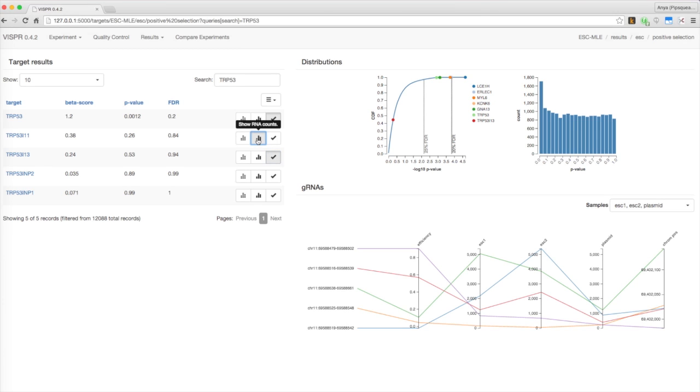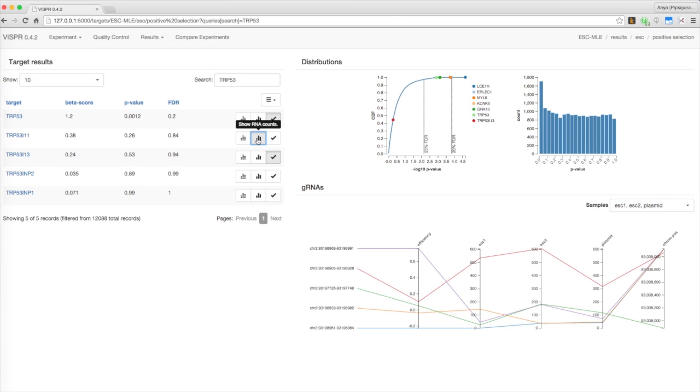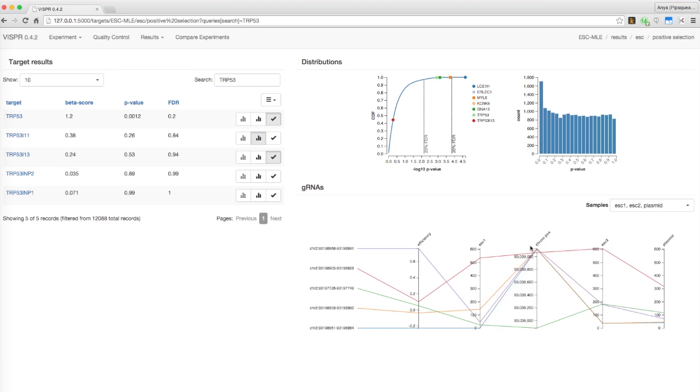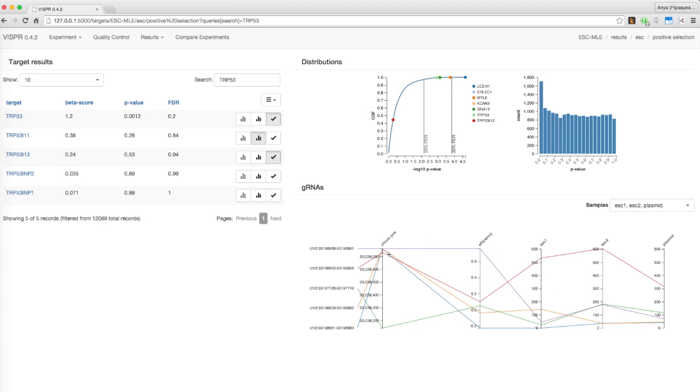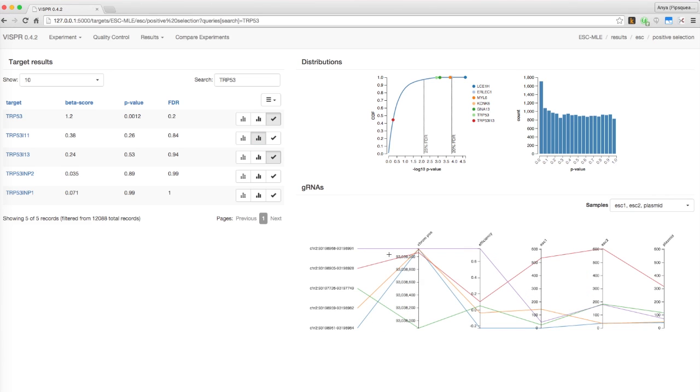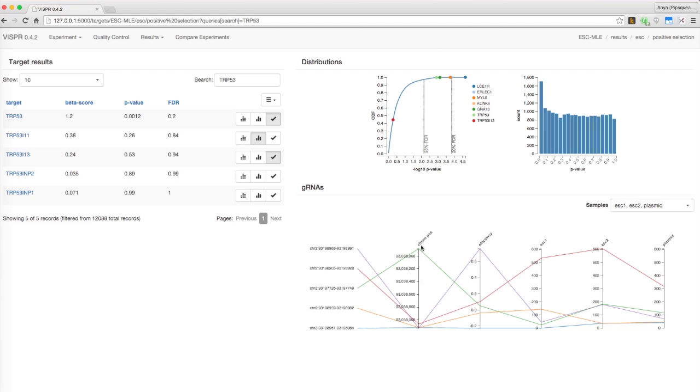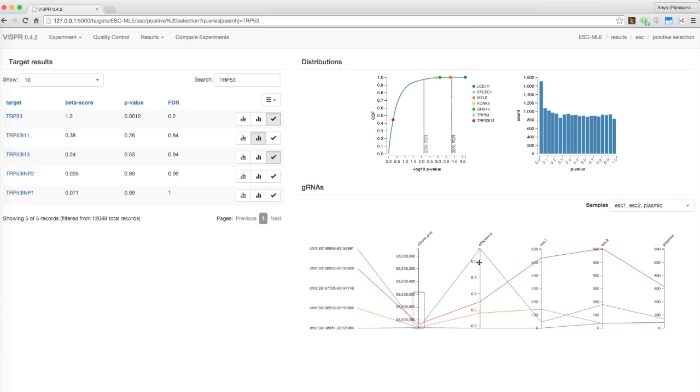Clicking on the middle button next to a target displays a parallel coordinate visualization for the corresponding sgRNAs. The axes represent normalized counts for each sample as well as their efficiencies and chromosome positions. You can reorder the axes by dragging them around. Double-click an axis label to reverse it. You can highlight certain ranges on each axis to display only sgRNAs that fall within them. Get rid of a highlighted range by clicking outside of it.